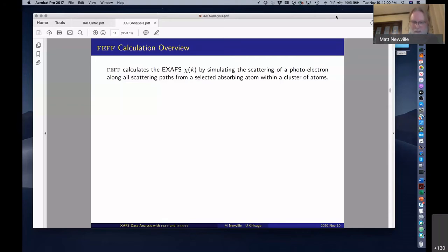In a different way, the number of free parameters and maximum likelihood affect it. You mean the F test? Yeah. Well, there are these statistics that are reported. I think if I get to an example, they'll be reported.